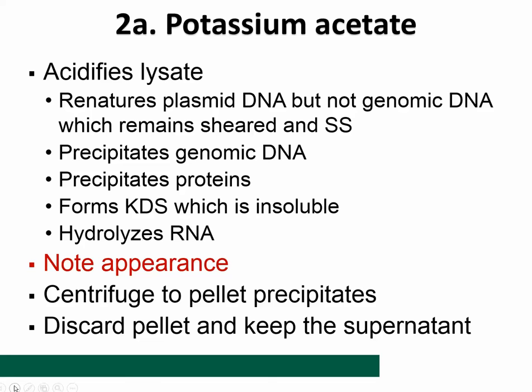And how about the genomic DNA? Well, it doesn't renature that because the genomic DNA is very large and it takes a while for it to come back together. Now, that's why in your isolation process, make sure that you do not shear the genomic DNA, because if you shear the genomic DNA into smaller fragments, those fragments will come together during the neutralization process.